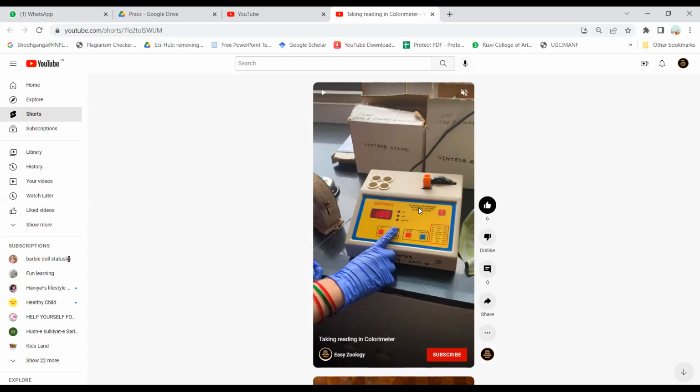That's why you will not take the colors of the blank. To exclude the chemical's colors, it is just like when we weigh something on the weighing balance, the petri dish weight is not required. So we use the tare option. Here we calibrate it with the blank.